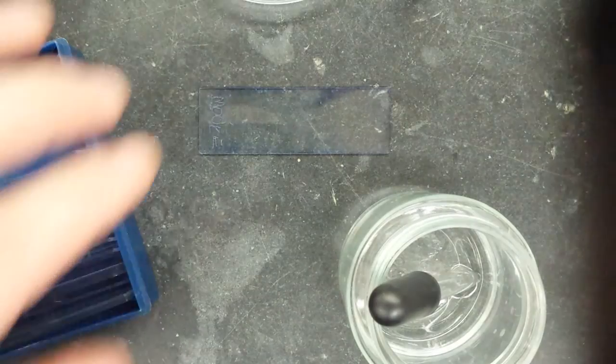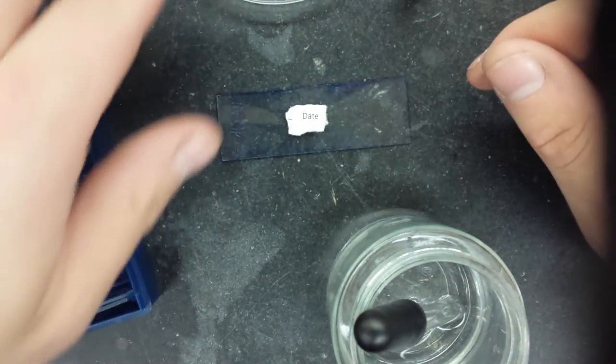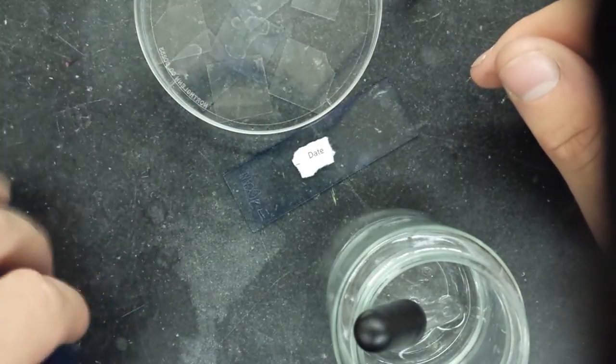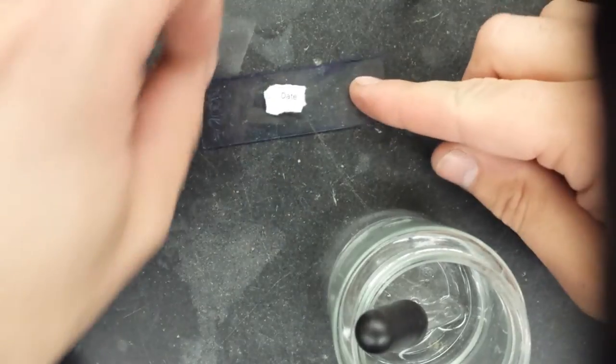It's really hard to pick up and you just position it on the slide as such, usually in the middle is best. Then you need a cover slip which are in here, so here's my cover slip.